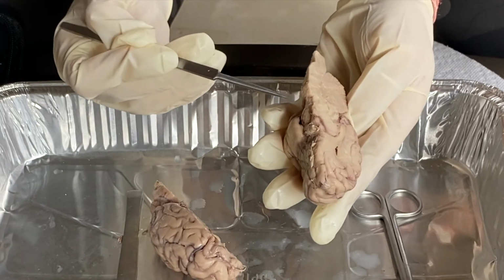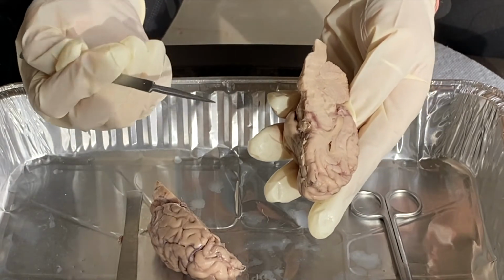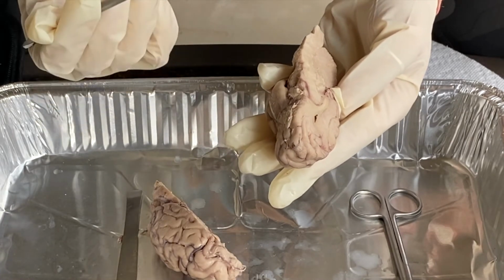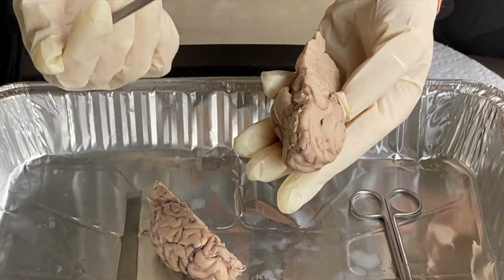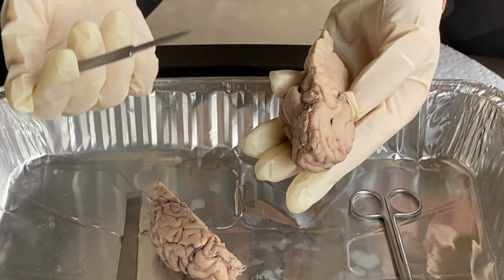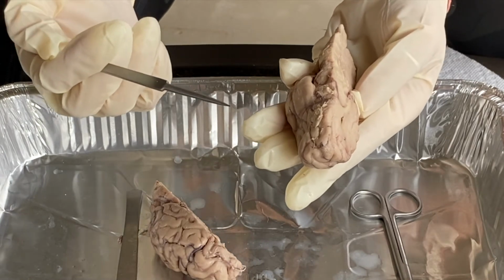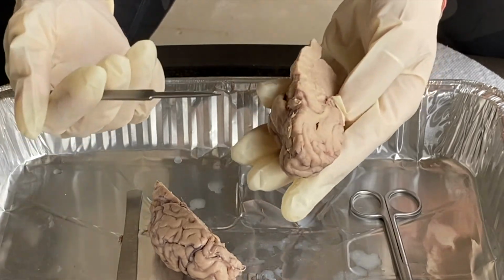This is also known as the master gland because it releases the hormones that control so many different processes in the body. It has two parts, the anterior as well as the posterior. Your anterior produces and secretes 7 hormones that include FSH, LH, adrenocorticotropic hormone, thyroid stimulating hormone, prolactin, endorphins, and growth hormone, whereas your posterior pituitary gland stores and secretes ADH and oxytocin. These hormones are not produced by the posterior pituitary gland, but are in fact produced by the hypothalamus.